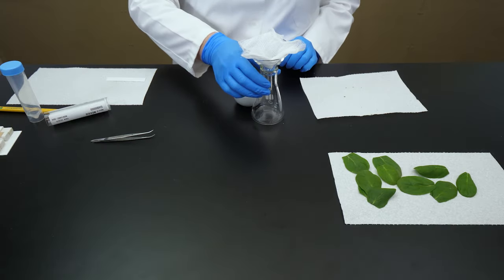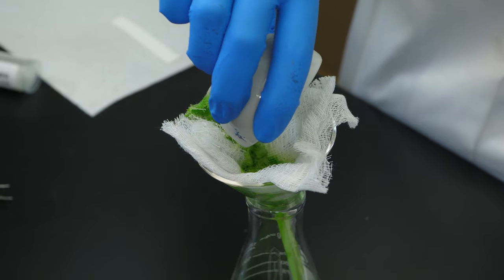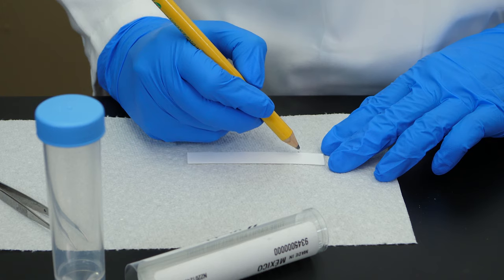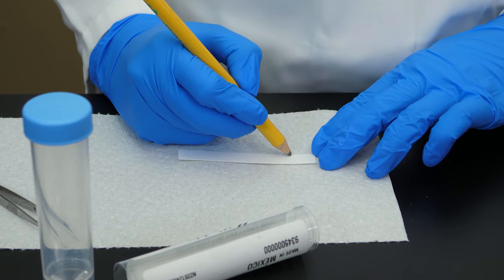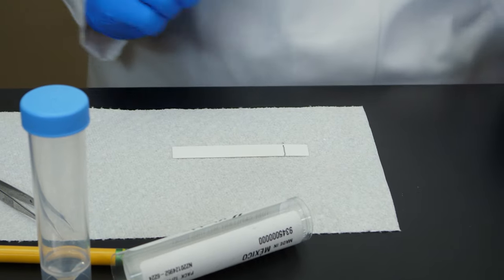After five minutes, we strain the contents to separate the leaf pieces from the pigments. Next, we take a thin strip known as a chromatography plate. With a pencil, we make a line near the bottom of the plate. This is the origin line.